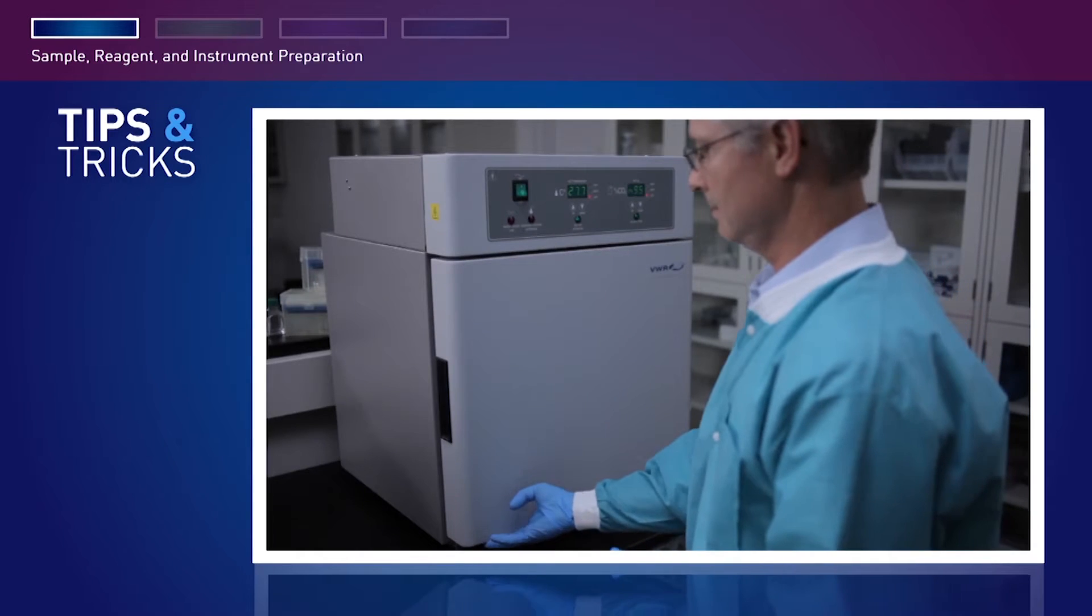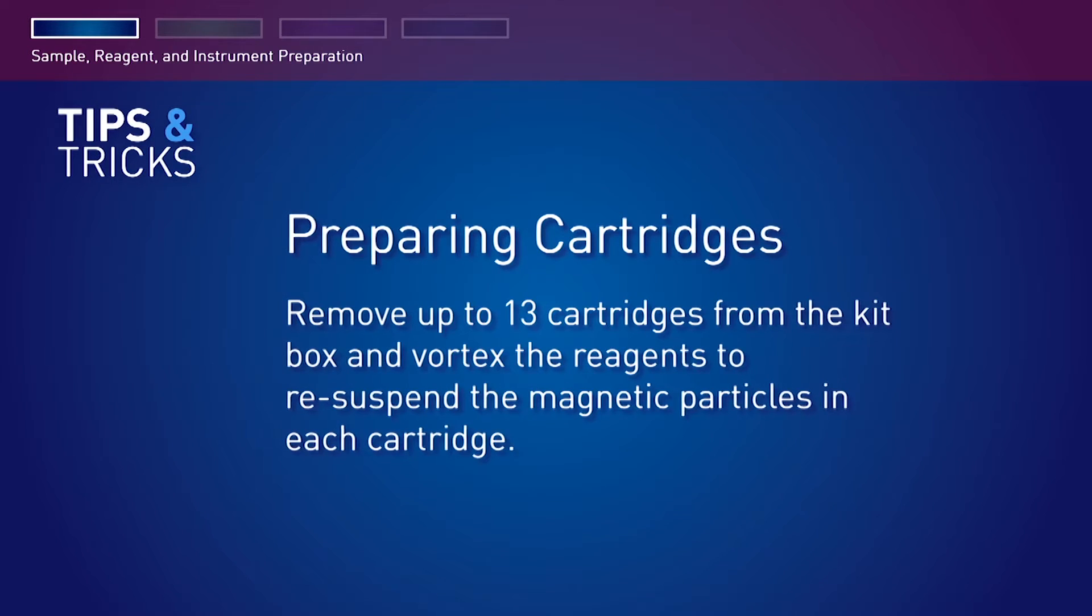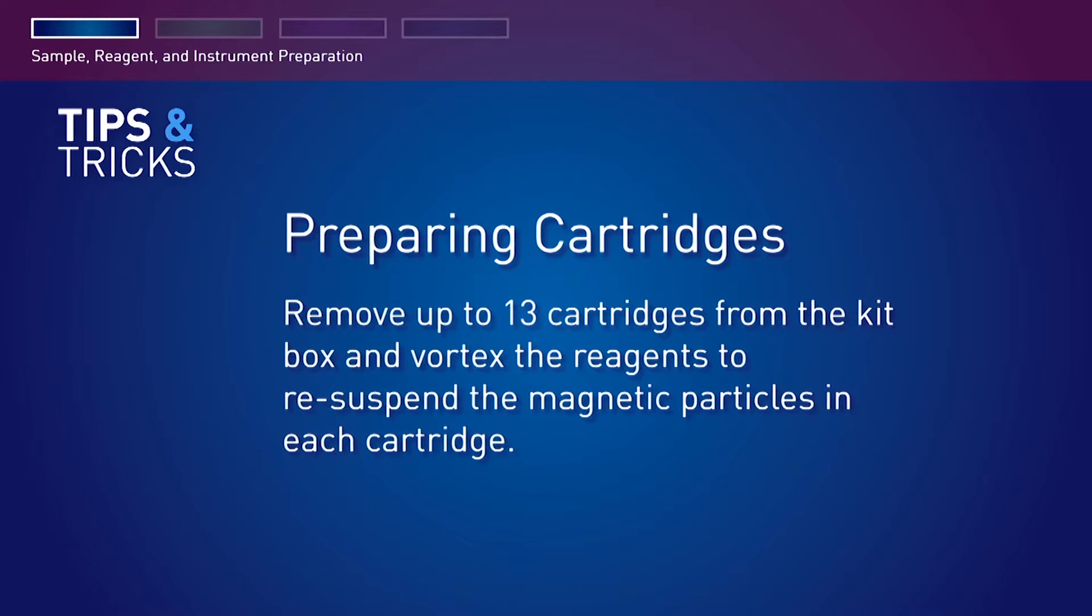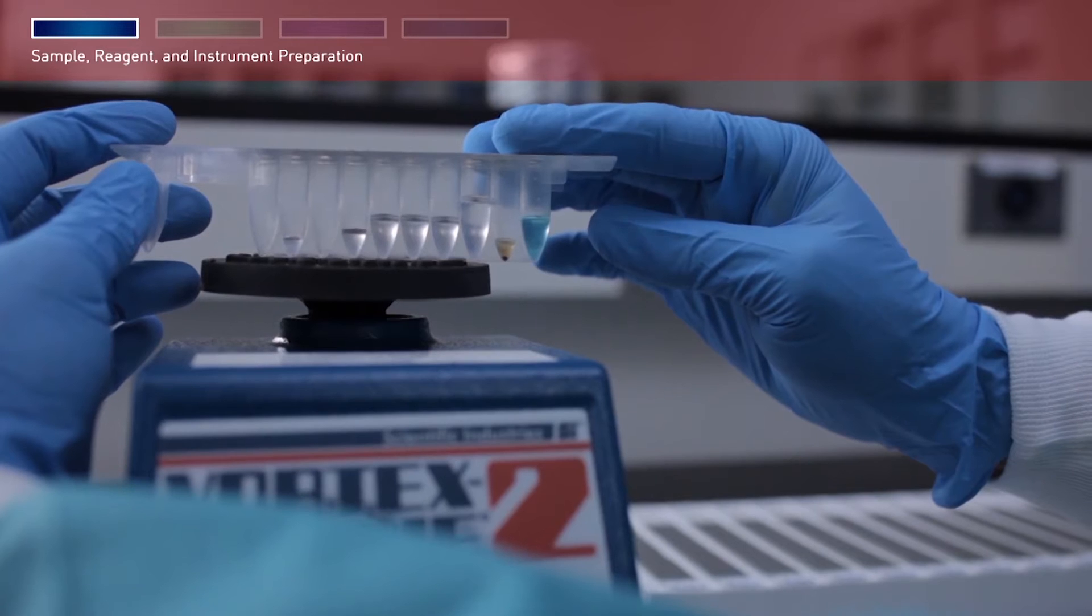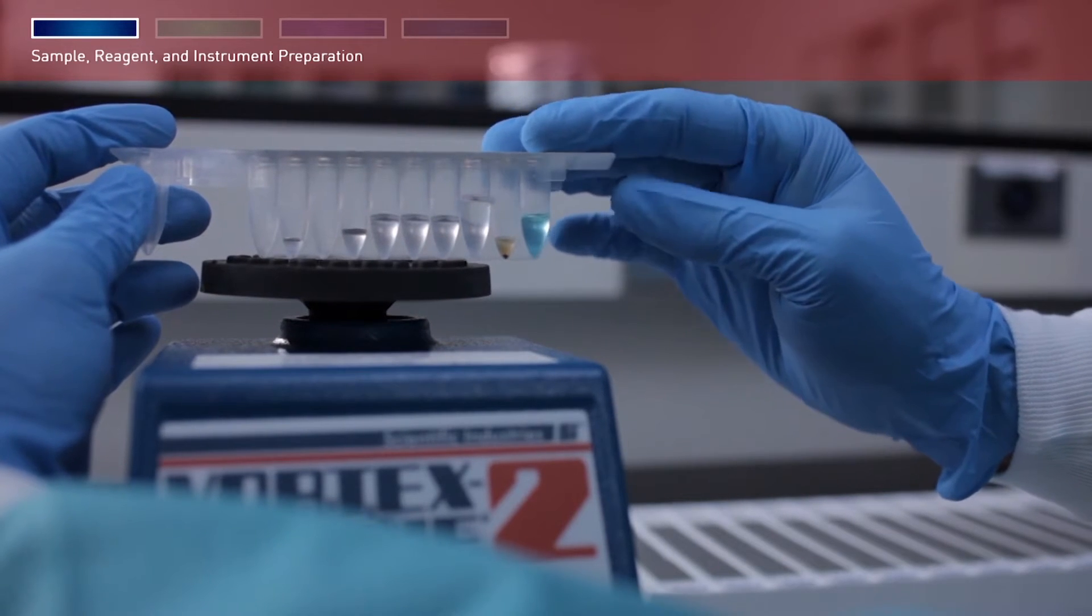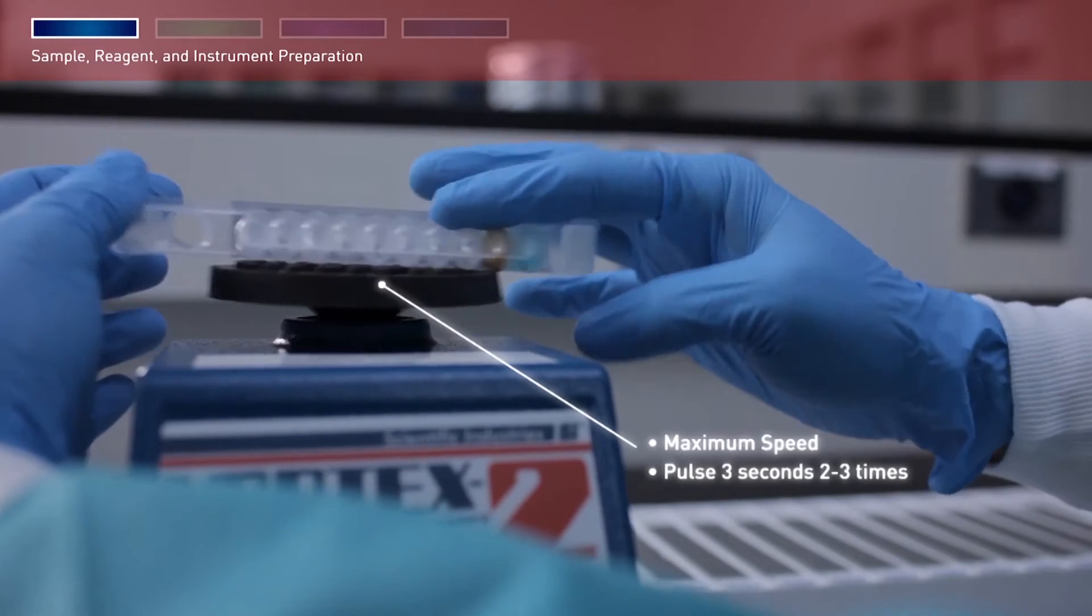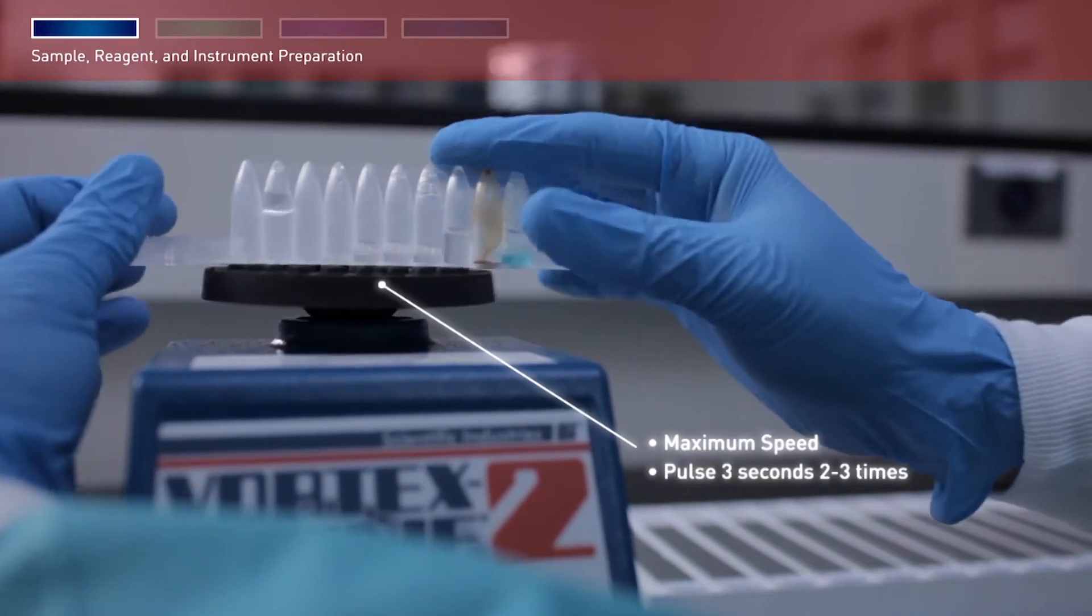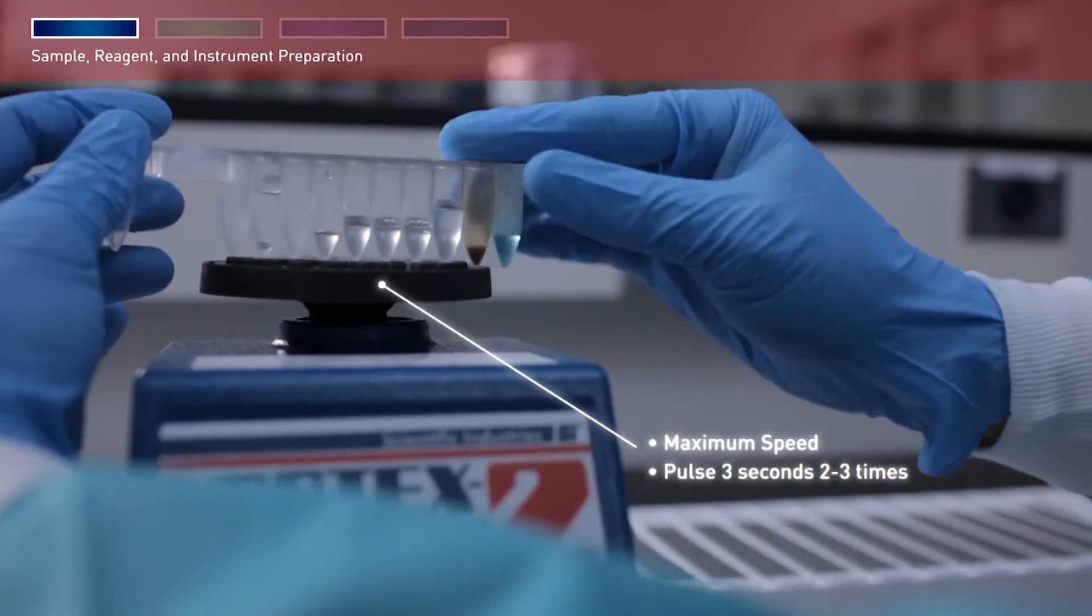Remove up to 13 cartridges from the kit box and vortex the reagents to resuspend the magnetic particles in each cartridge. Hold the cartridge foil side up on a vortexer set to maximum speed, then pulse approximately three seconds two to three times. Repeat this step with the cartridge foil side down, then repeat again with the cartridge on its side.